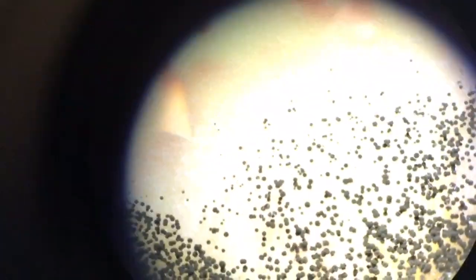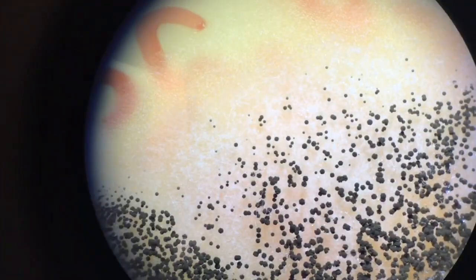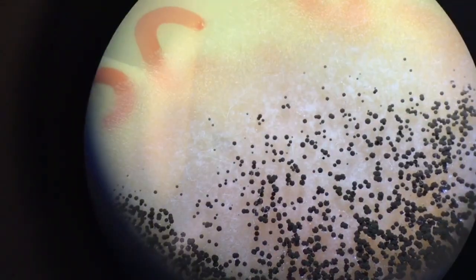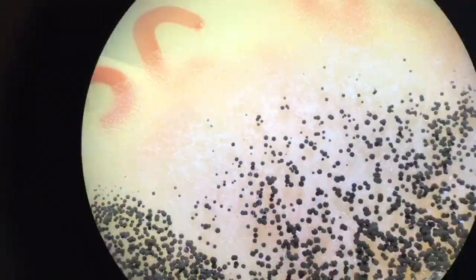You already saw the colony. The colony has a white mycelial mat and conidiophores that produce black conidia. Rhizopus of course also does this, so the devil is in the details.